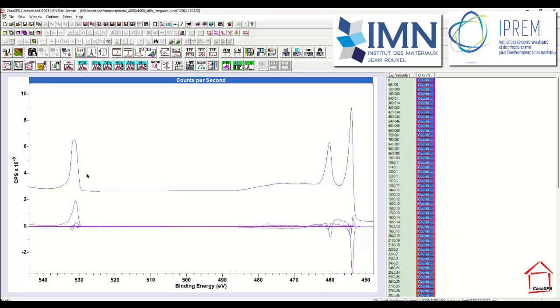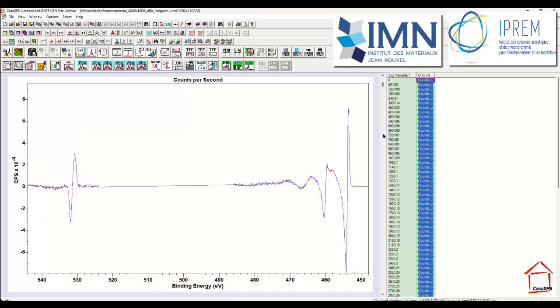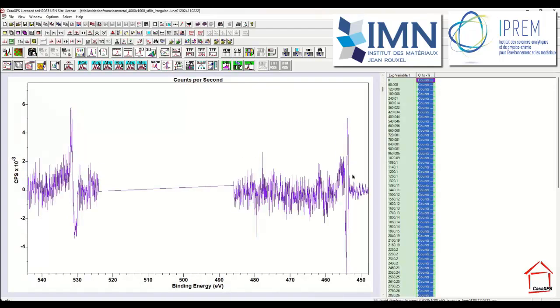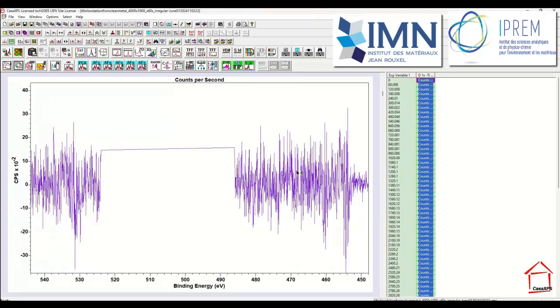And when I say reproduce the entire data set, what that means is that we have abstract factors. They're not necessarily spectroscopic in significance, but they are mathematically significant to the data itself. So if we were to take the abstract factors that just have signal, that's obvious signal, more signal here, until we ultimately reach a point where it looks mostly like noise. So if we only take the abstract factors, all of these above this point, they appear to have some shapes of significance to the signal, not just noise.